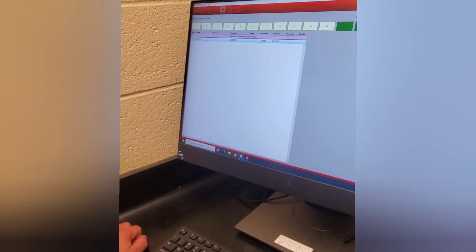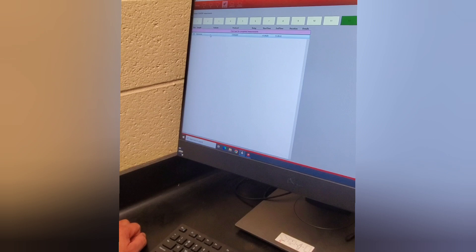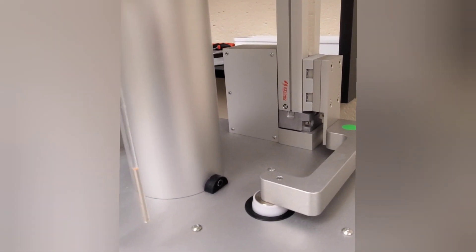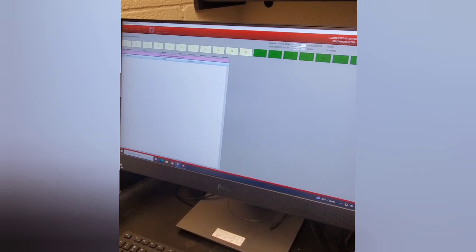It's very important that slot number 20 with the water is always inserted into the instrument. You can see right now that slot number 20 is the one that's inserted. We always want to begin that way and also end that way.